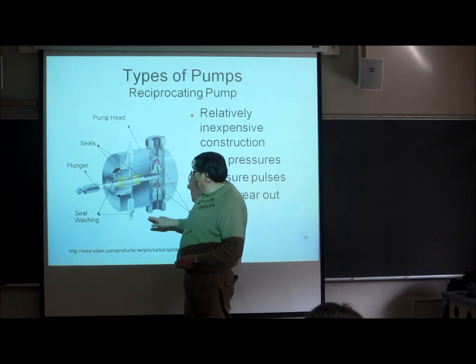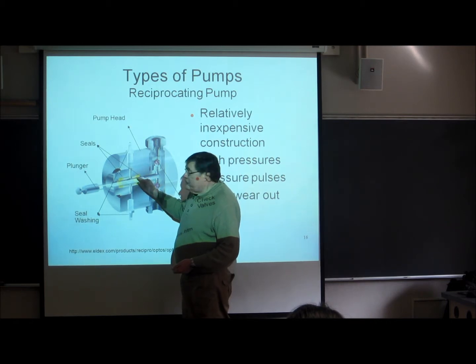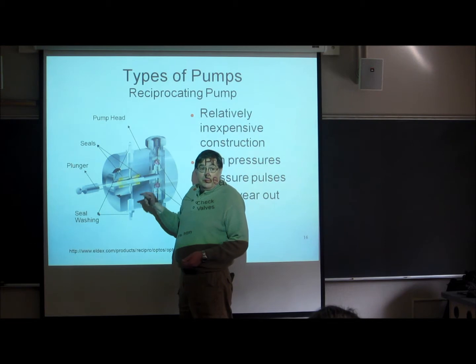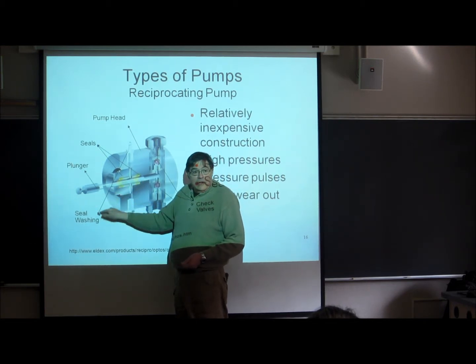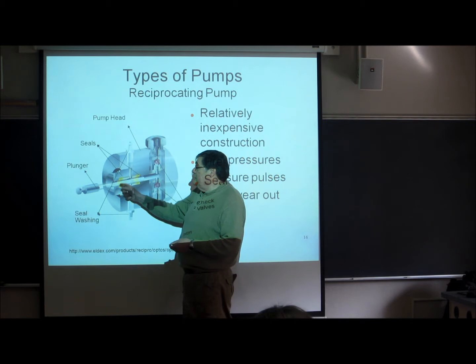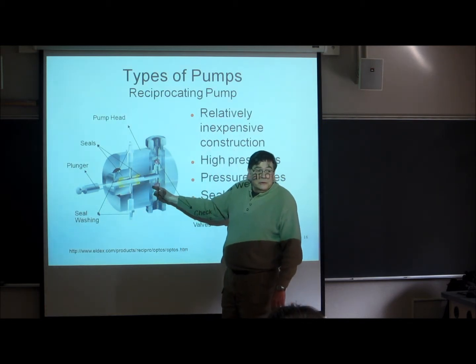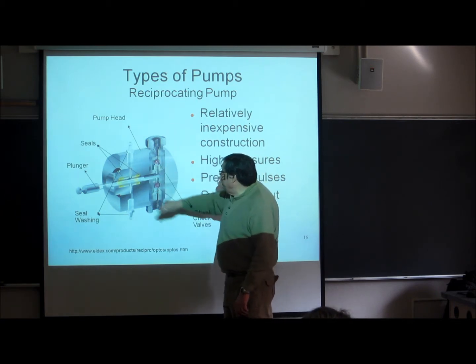Now, if you have some particles coming in with the liquid, and those particles get around this piston, unless this is an extremely hard material here, it's going to abrade the piston and cause some channels for leaking, and you're going to get leaking of solvent out here. It won't cooperate at higher pressures. Another material commonly used now is silicon carbide, another incredibly hard material. Okay, so there are seals in this thing.